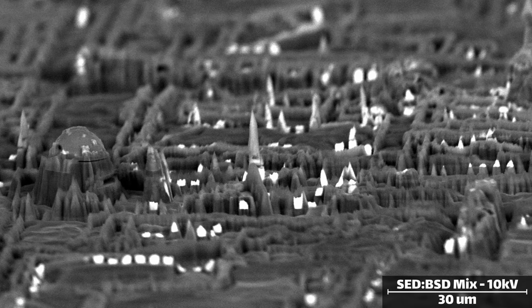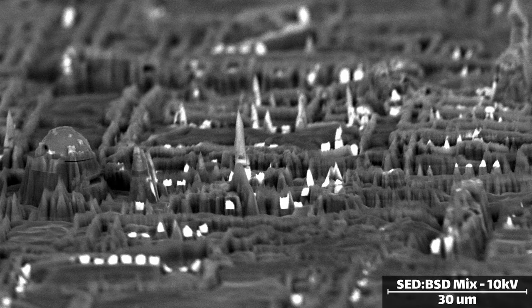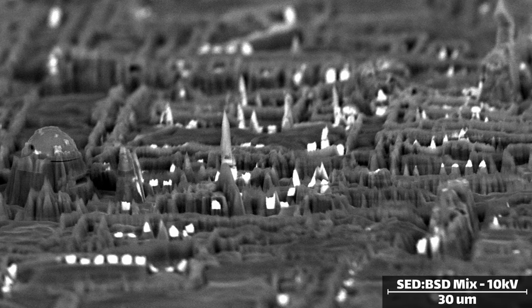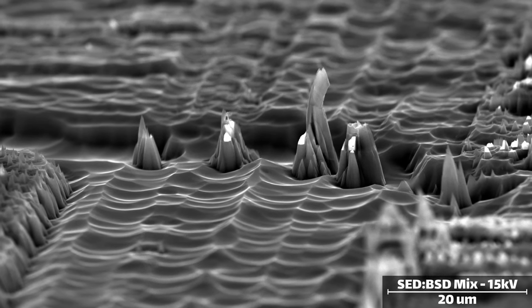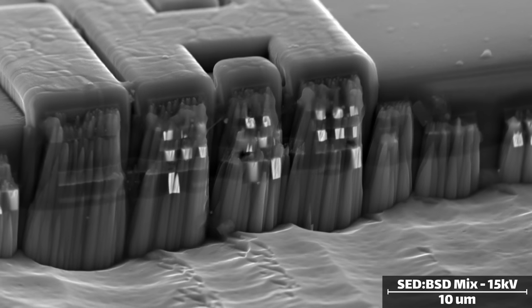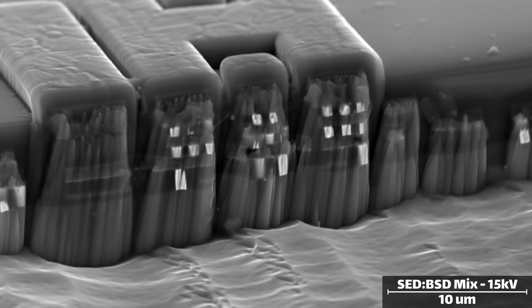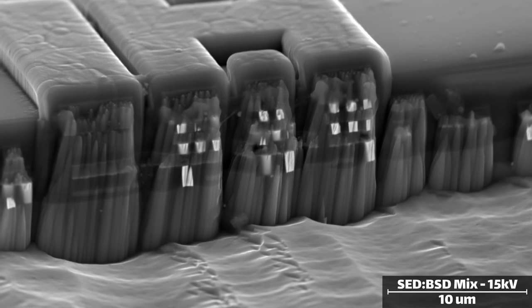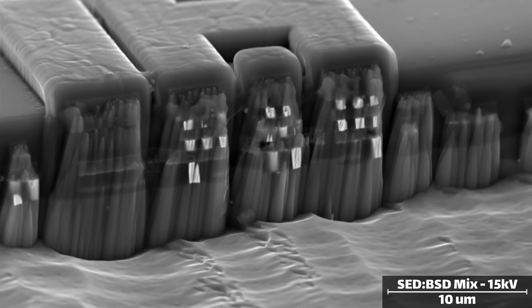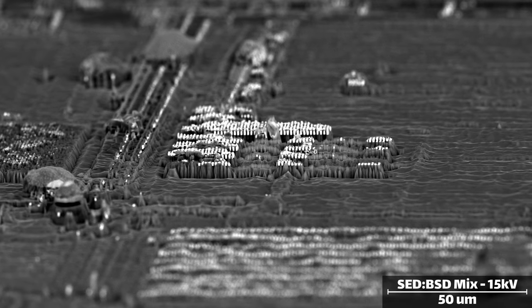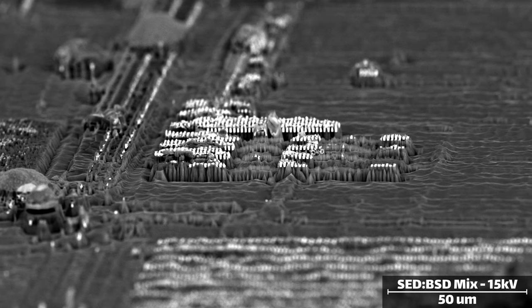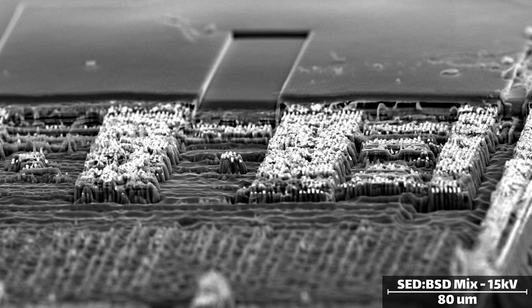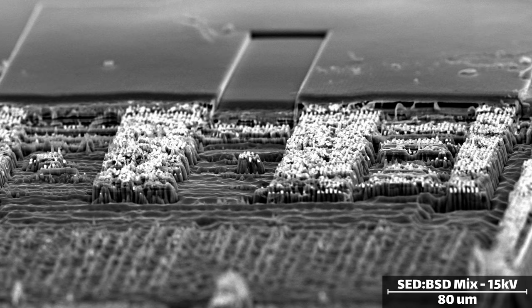We can also see these little spikes scattered all around. There's almost always a bright dot at the top of that spike, and that bright dot is a tungsten via from the semiconductor chip. Ion milling will etch all materials, but it will etch some materials slower than others. Tungsten is pretty resistant to ion etching, so it's removed a lot slower than the surrounding silicon and aluminum. The tungsten acts as a tiny little mask protecting the material directly below it. And we're left with these spikes.